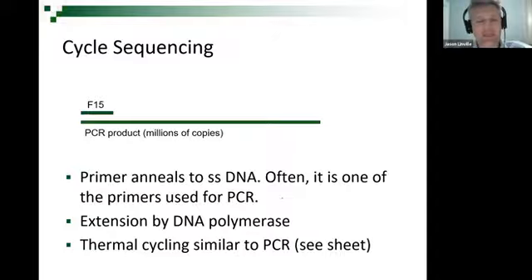Okay, that's it for amplification. It's the exact same, except the primers are going to be a little bit different. It's still 4 things going into the tube: DNA, Taq polymerase, dNTPs, primers, forward and reverse. One set of primers because we're amplifying one area of mitochondrial DNA. Okay, now cycle sequencing. Here, we had our amplified DNA.